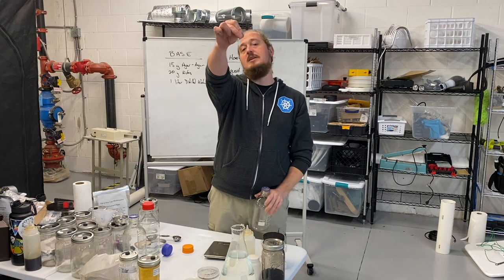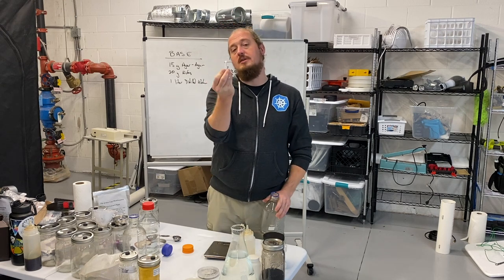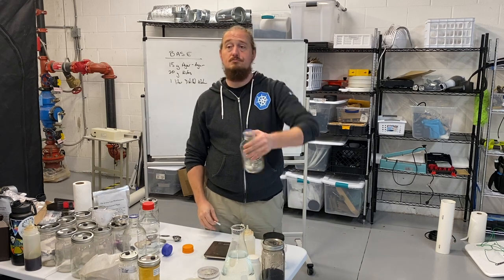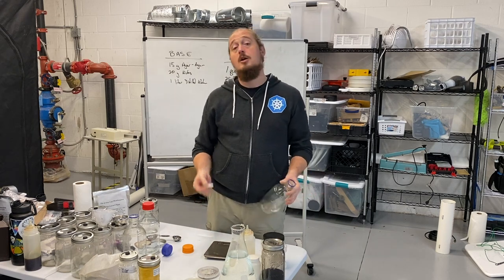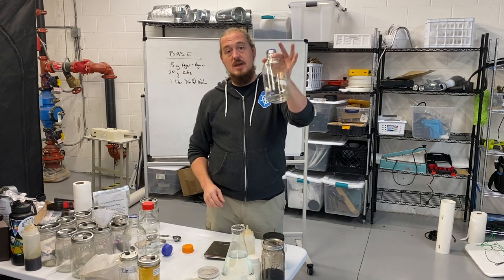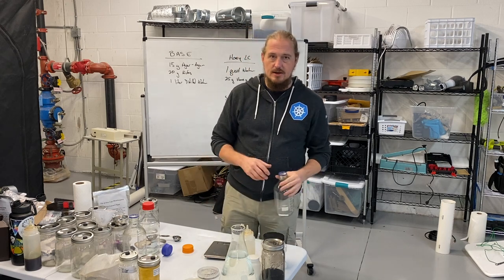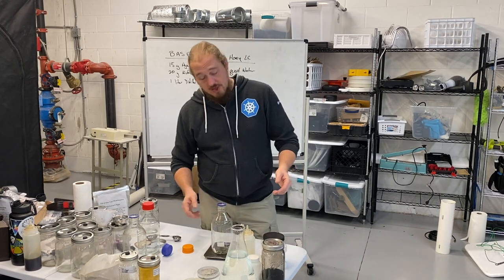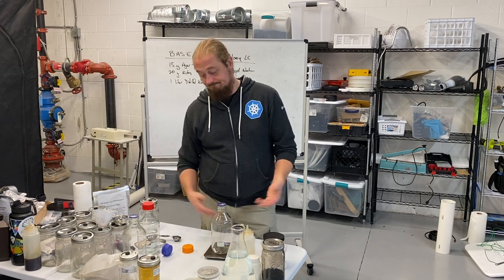This is a magnetic stir bar. If you don't have a magnetic stir plate or a magnetic stir bar, you can put marbles, nails, anything. Basically you want something in there that will agitate the mix and help you get it nice and homogenized before you pour. Put that on the scale and tare it out.